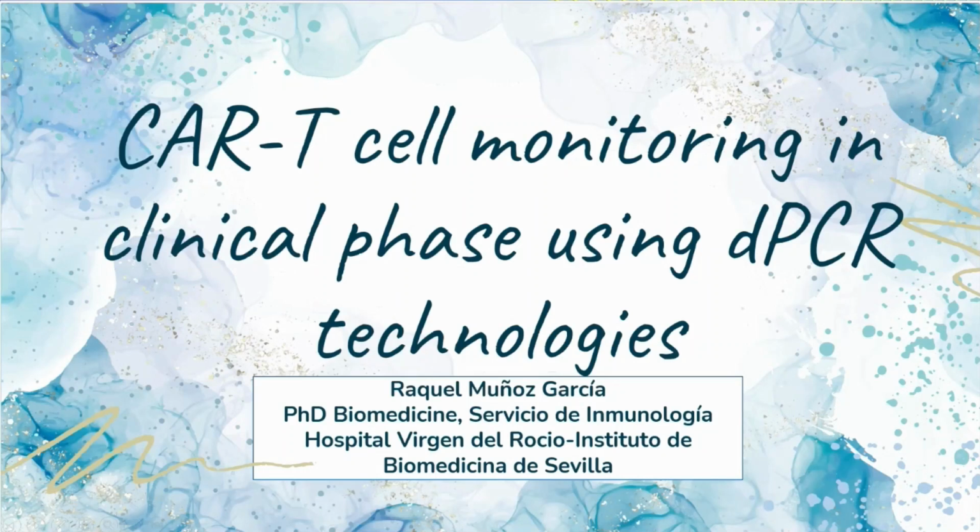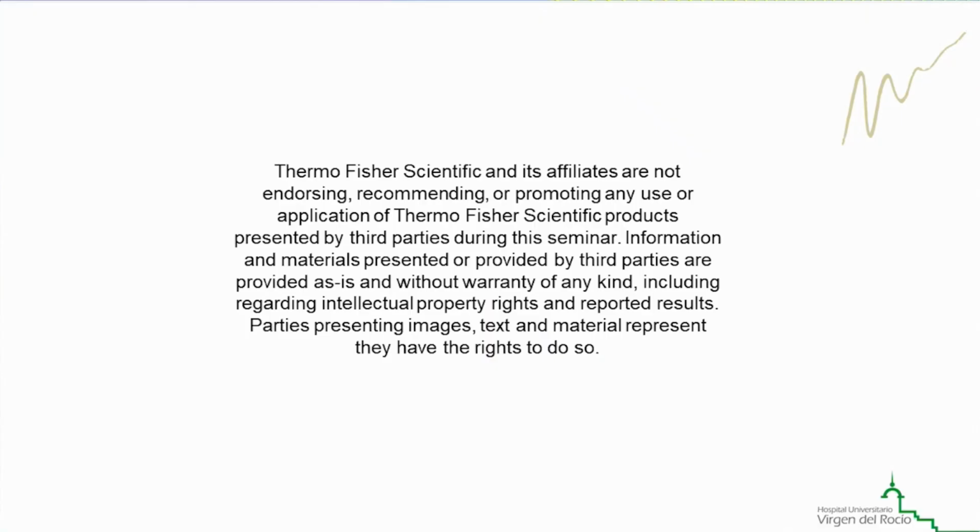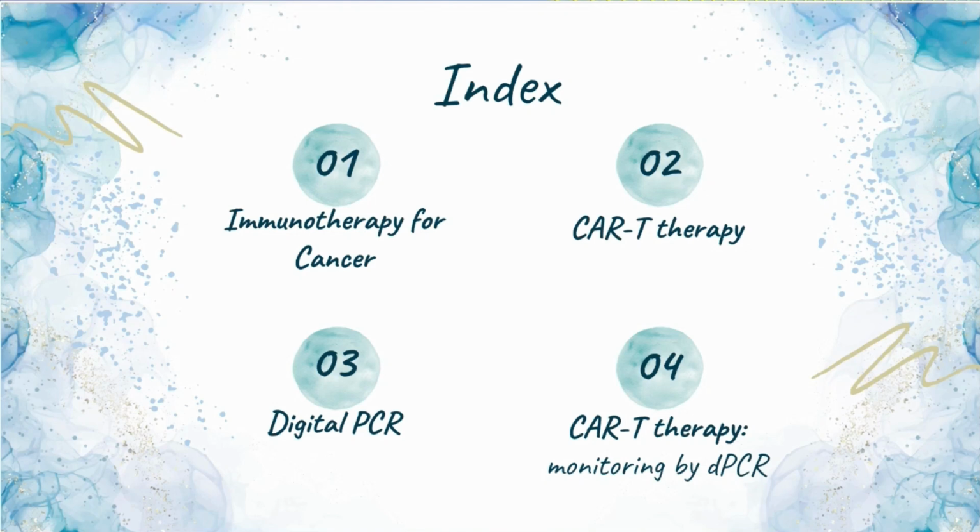Hello, my name is Raquel Muñoz, and I'm an immunologist at Hospital Universitario Virgen del Rocío in Sevilla. And I'm going to talk about CAR T-cell monitoring in clinical phase using digital PCR technologies. This is the script that I will follow during the presentation. First, I'm going to explain what immunotherapy for cancer is, and I will focus on CAR T therapy, digital PCR, and how to monitor CAR T therapy with digital PCR.